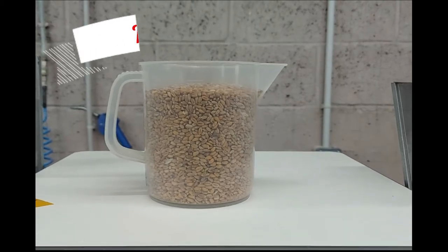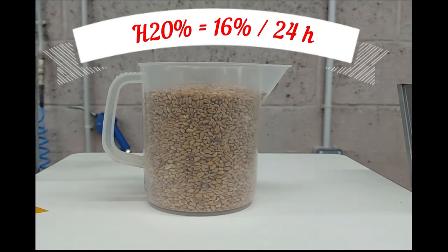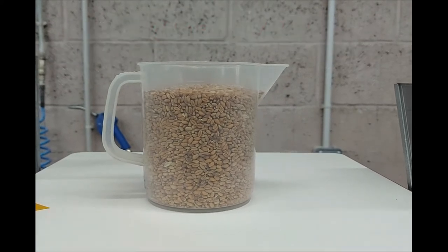This wheat must also have been tempered in order to facilitate the separation of the bran and the flour. Conventionally, wheat moisture is brought to 16% by adding water, and the wheat is left to stand for 24 hours.